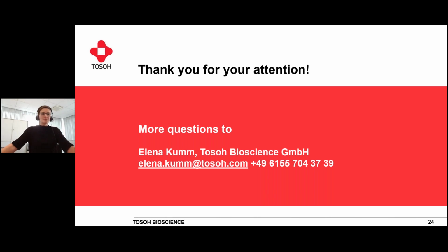Yeah. Perfect. And I've got one more here. So how do you choose what SEC column is good for that application? What tends to be the cutoff range? I assume that means in terms of molecular weight.